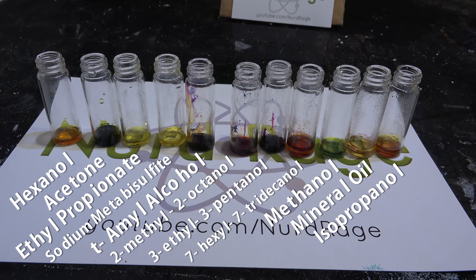Exactly what those products are is different for each one, and even the literature isn't entirely clear on the subject. Unfortunately, as a technique to figure out what we have, this is a failure — everything is different and there doesn't appear to be much consistency between functional groups. For example, methanol, a primary alcohol, is green, but hexanol, also a primary alcohol, is red. Maybe the issue is size, as isopropanol is also red — but then how come t-amyl alcohol is purple while 7-hexyl-7-tridecanol is red? Even stranger, mineral oil, which is normally inert to most reactions, is turning red. The Komorowski reaction is not very good for identifying an unknown compound. It's not totally useless though — you can run it with an unknown sample alongside a known reference and see if they match. But if you have no suspicion what your unknown sample is, then all this does is give you pretty colors.